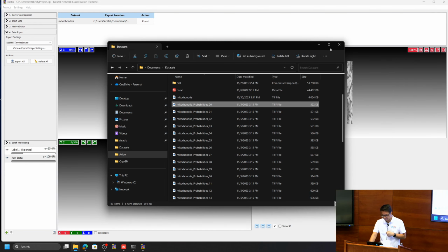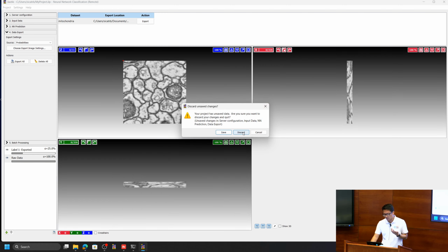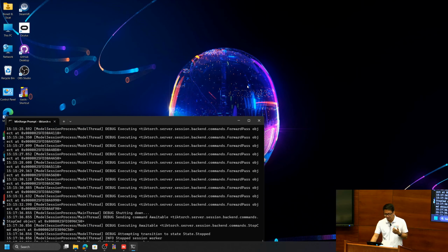All right. So that's kind of how it looks like. Super easy, actually, right? You just give your input data, pick a model, load the model, apply the prediction, export to Avizo, okay? As I said, the disadvantage is you don't really have control over the model, okay?